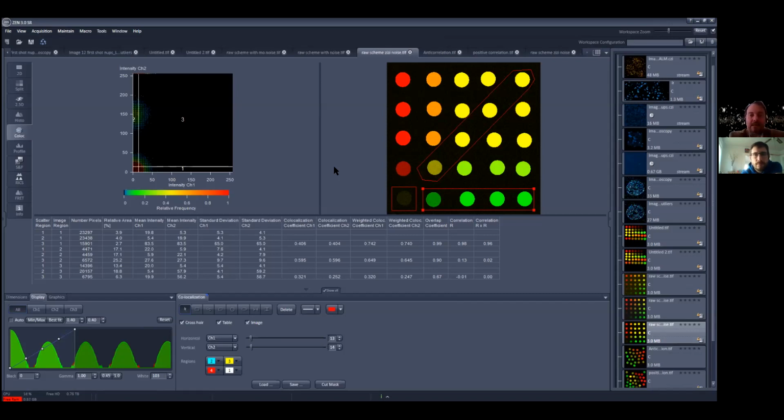Or noise analysis, if you take the image and another image, then the correlation will be, of course, perfect, but the spread, the cloud, how much it spreads from the diagonal will tell you how much noise your detector has. There are several useful ways to abuse the co-localization tab that go outside of the co-localization and more aptly, you know, the co-intensification. Exactly.